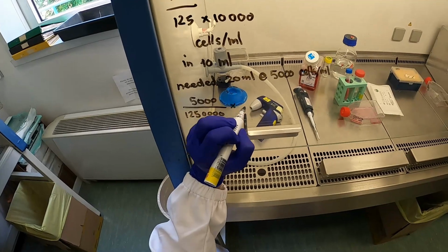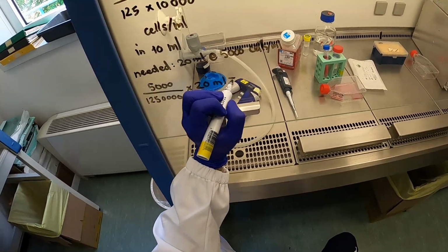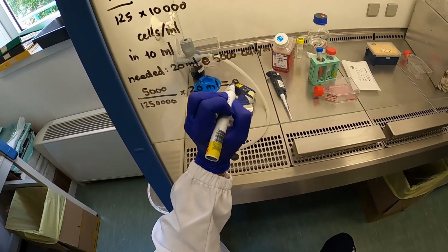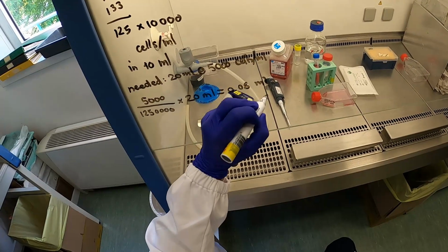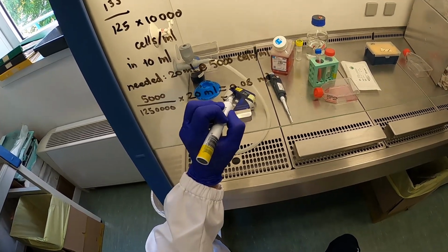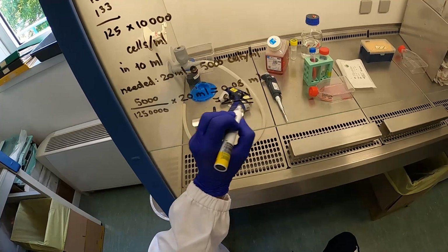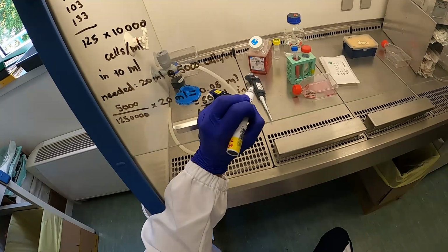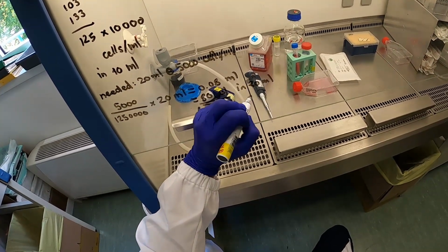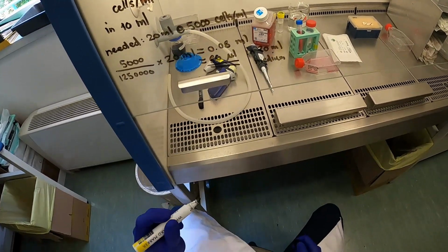So let's take 5,000 divided by 1.25 million times the volume that we want to make, which is 20 ml, gives us 0.08 ml, which is 80 microliters. So we need to introduce 80 microliters of our cell suspension into 20 mLs in order to have a concentration of 5,000 cells per ml.